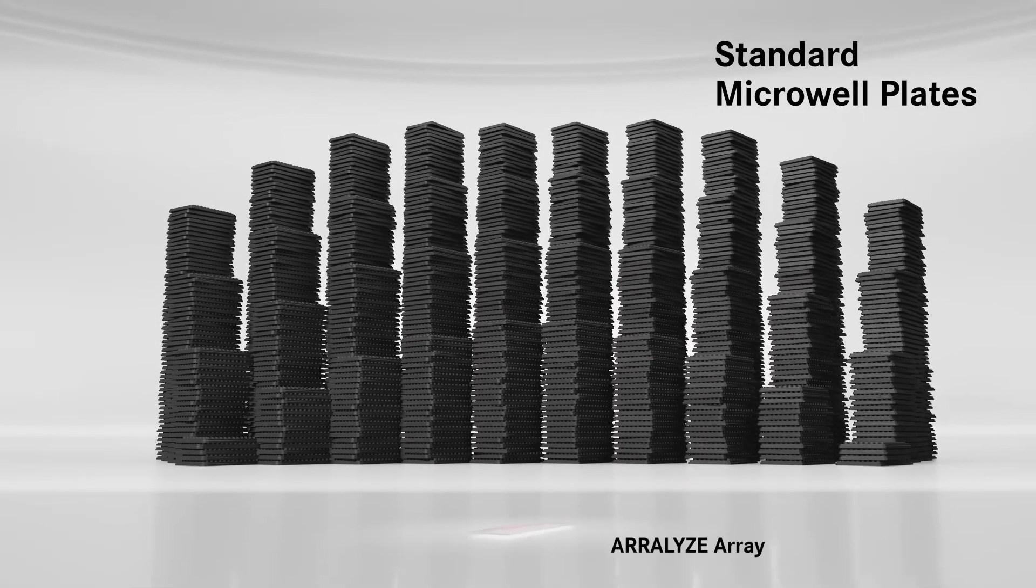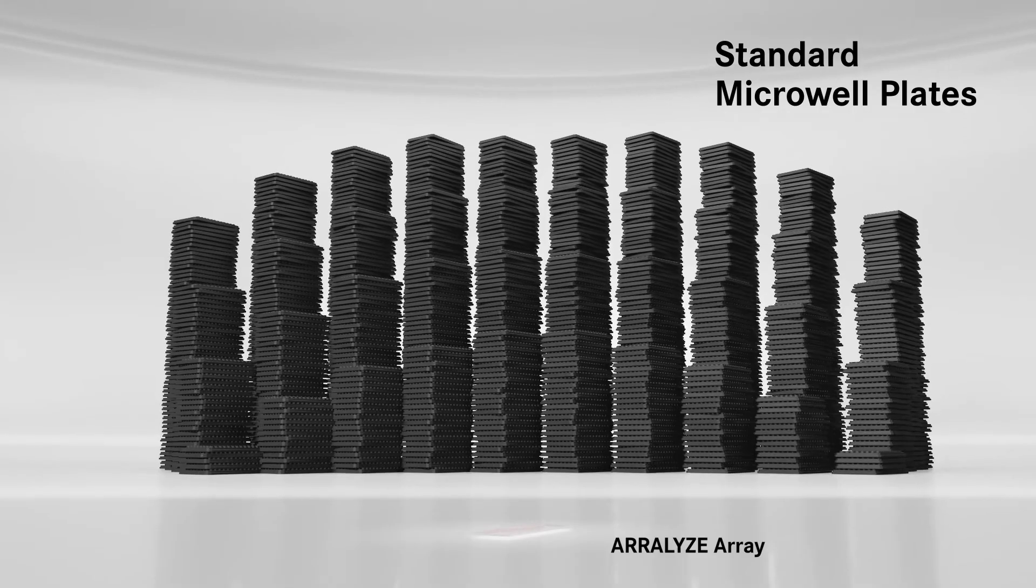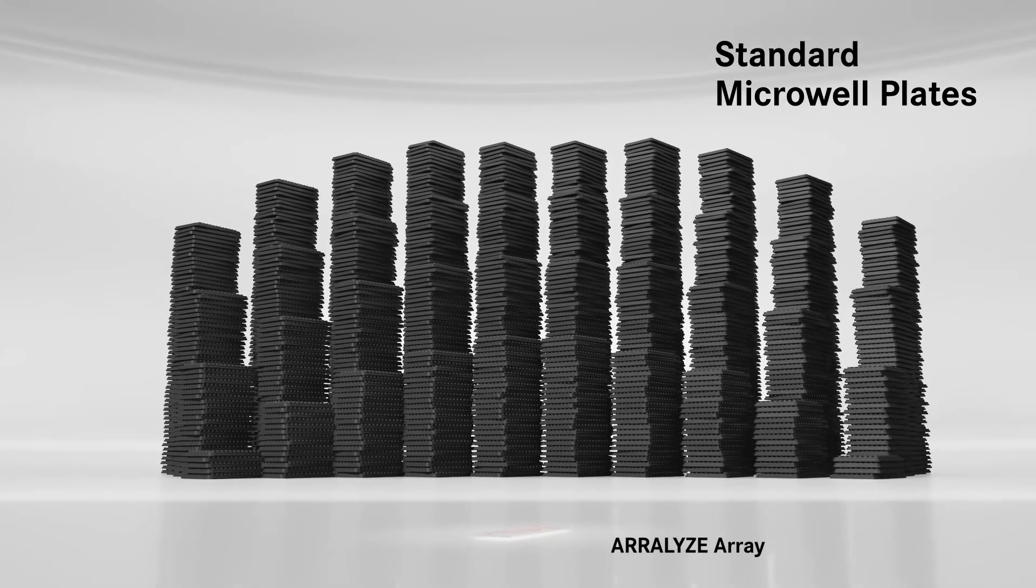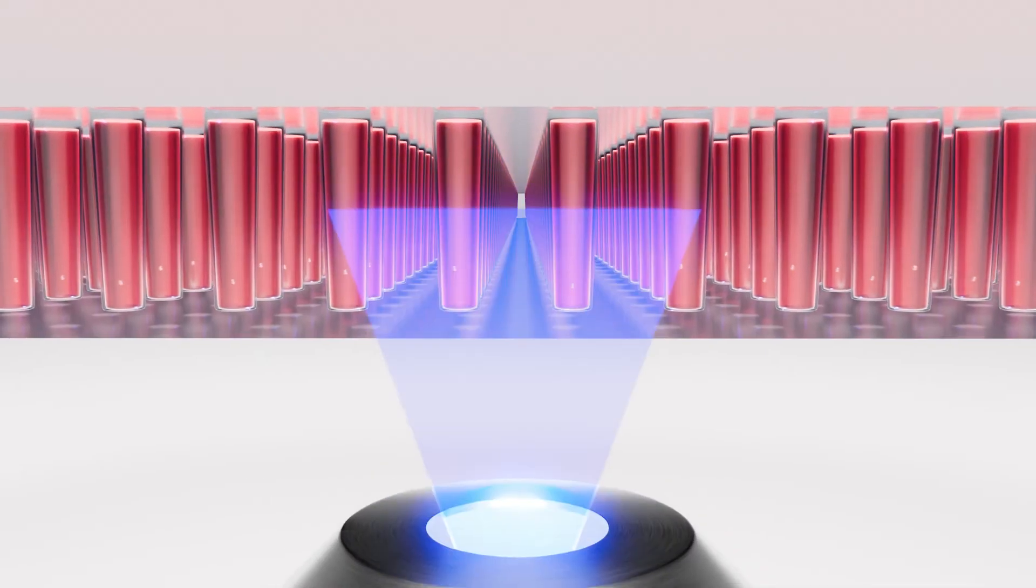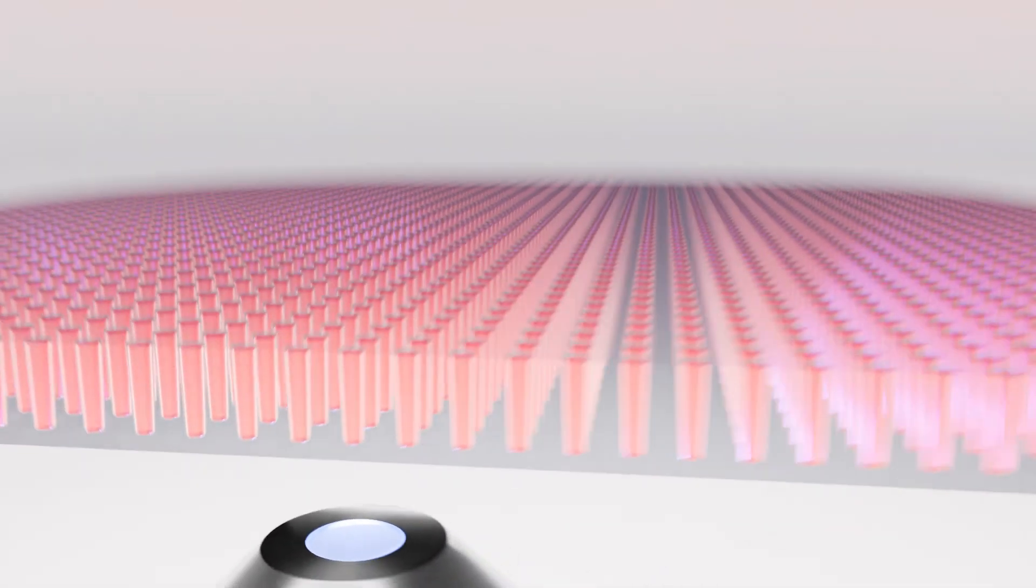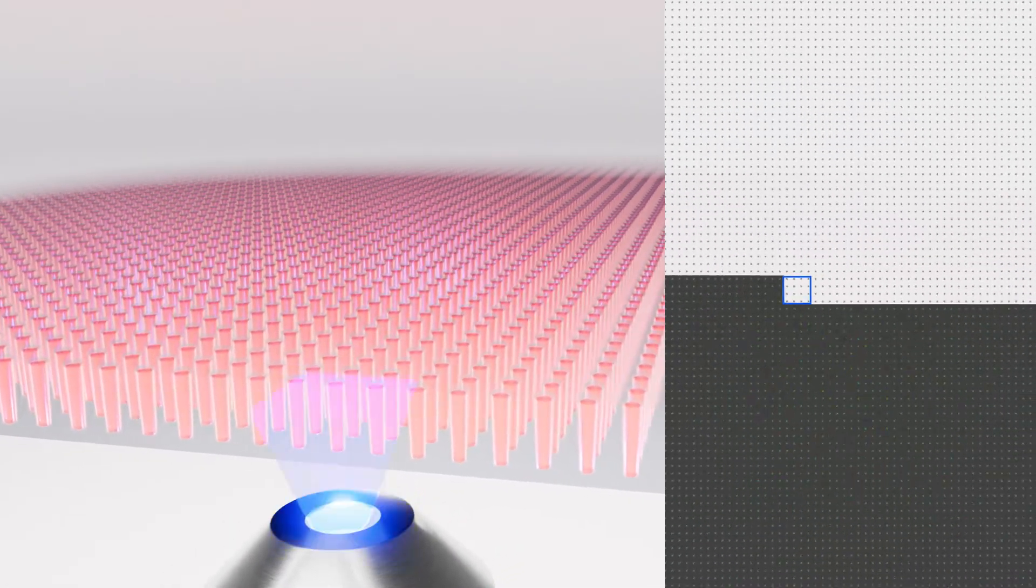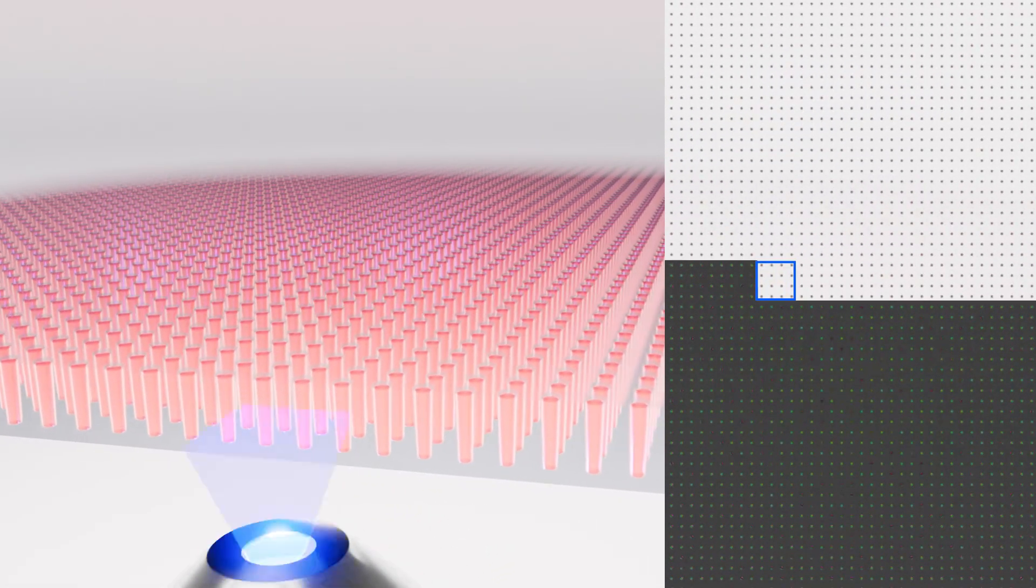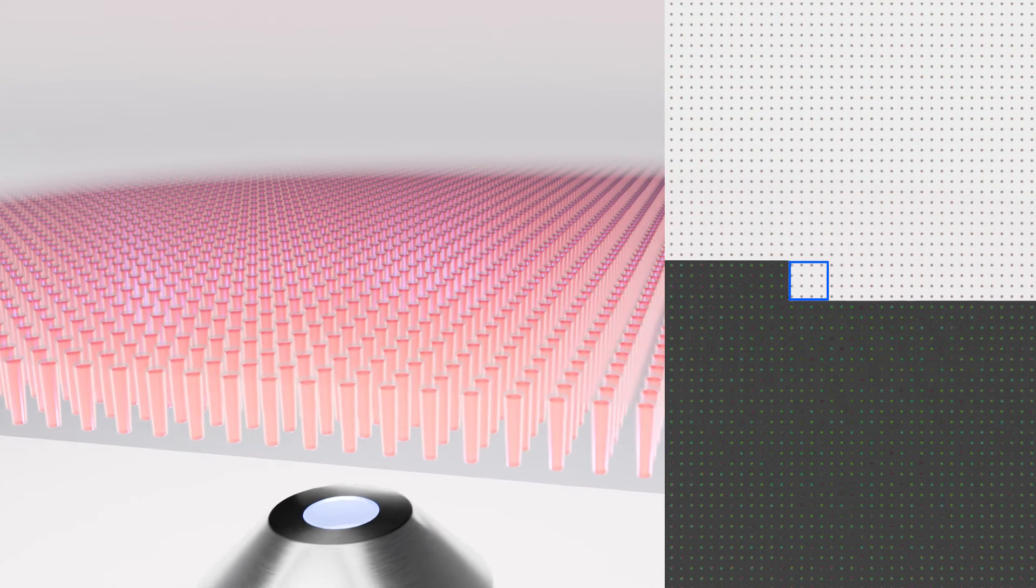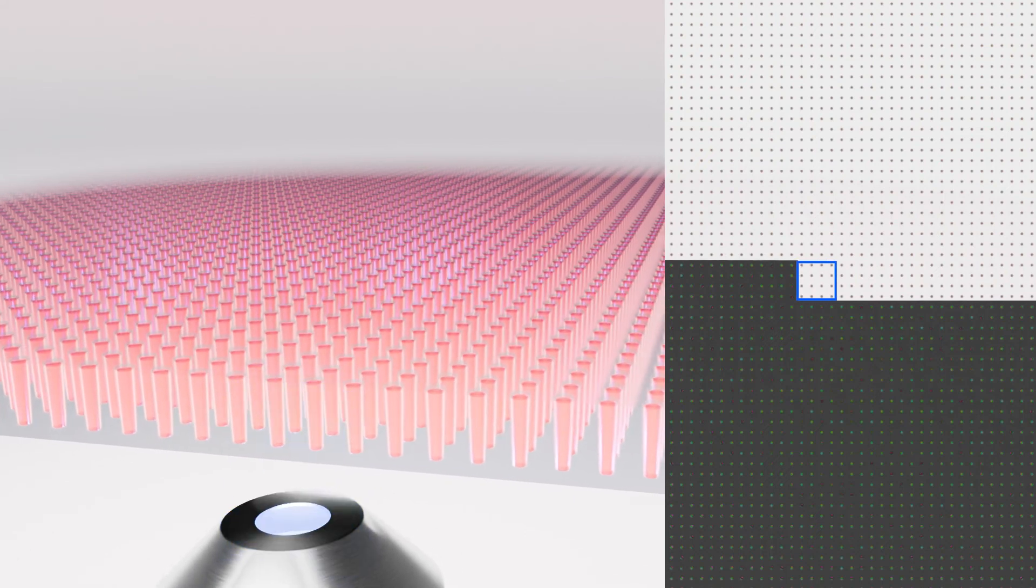After printing, as well as at any time during the experiment, the wells can be imaged with standard microscope techniques. The high-density nano-well arrays allow to image several wells at once, enabling faster screenings.